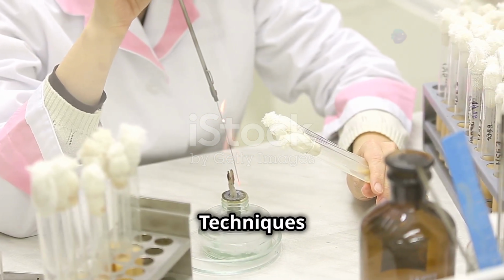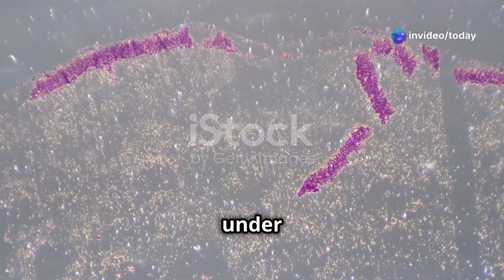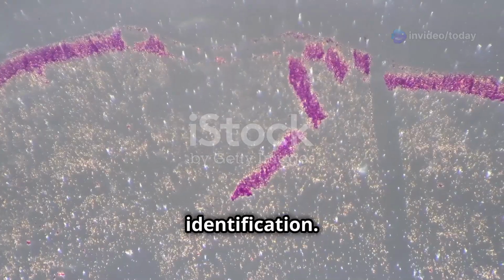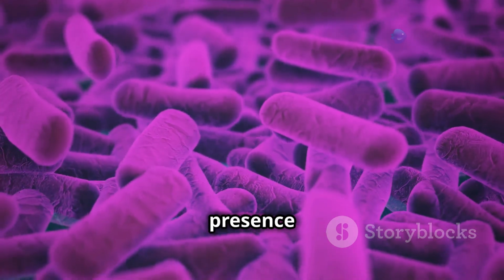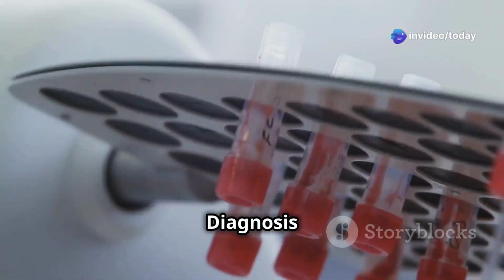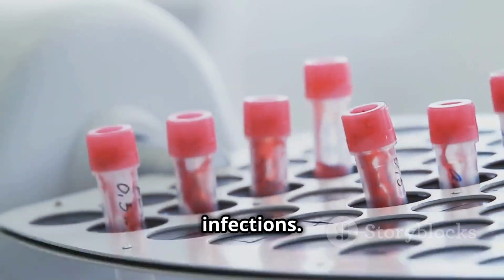Importance of staining techniques. Visualization. Staining makes bacteria more visible under a microscope, allowing for easier observation and identification. Classification. Staining techniques can help classify bacteria based on their cell wall structure, presence of endospores, and other characteristics. Diagnosis. Staining techniques are used in clinical microbiology to diagnose bacterial infections.